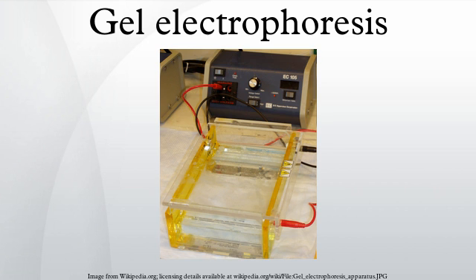Gel electrophoresis is used in forensics, molecular biology, genetics, microbiology and biochemistry. The results can be analyzed quantitatively by visualizing the gel with UV light and a gel imaging device. The image is recorded with a computer-operated camera, and the intensity of the band or spot of interest is measured and compared against standards or markers loaded on the same gel. The measurement and analysis are mostly done with specialized software. Depending on the type of analysis being performed, other techniques are often implemented in conjunction with the results of gel electrophoresis, providing a wide range of field-specific applications.